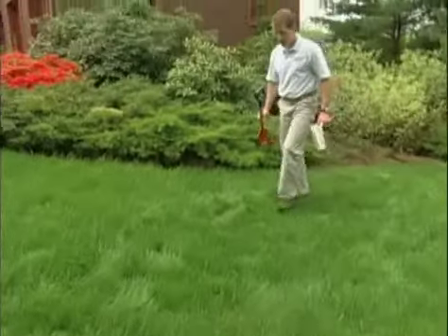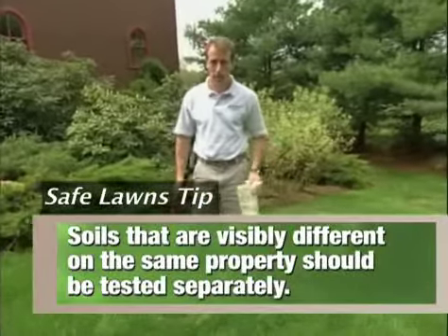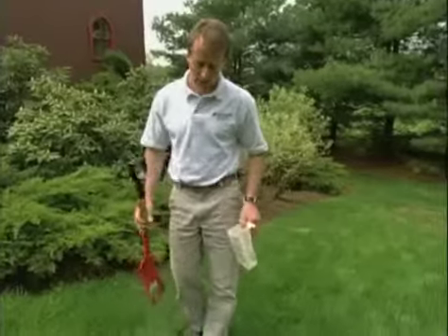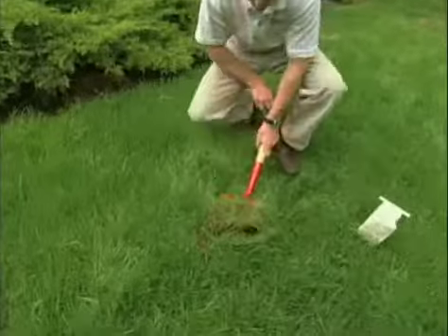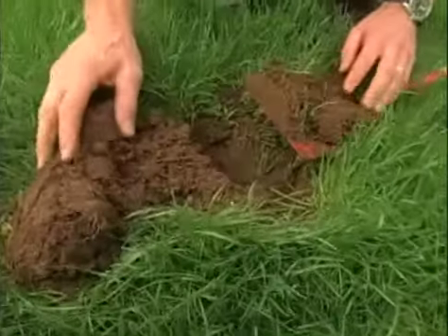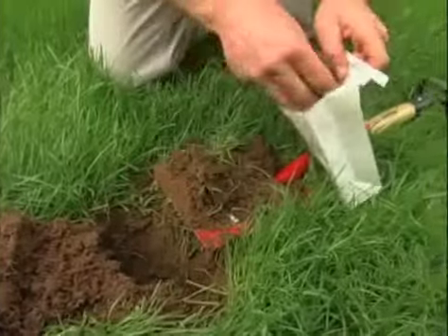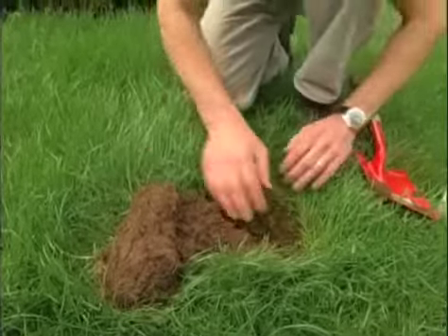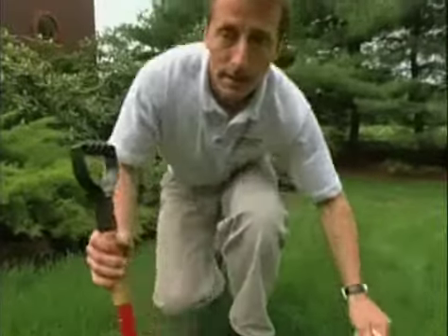As I make my way around the property, it's really important to note that if the soil looks different than the one that you just took earlier, you might want to take a second test, because it could be very different with its chemistry. So I'm going to take another sample here and see what it looks like. Oh, this is beautiful soil. As you can see, we have a lot of earthworms and a lot of root hairs. So I'm just going to take a small handful of the soil and put it in the bag with our other samples. And we'll want to cover it up so no one knows we were even here. Okay, let's bring it to the lab.